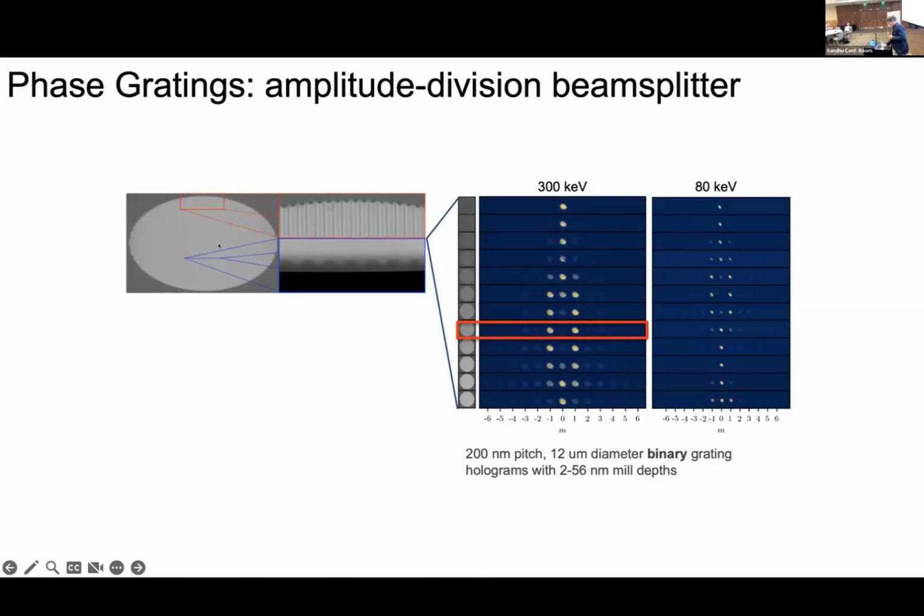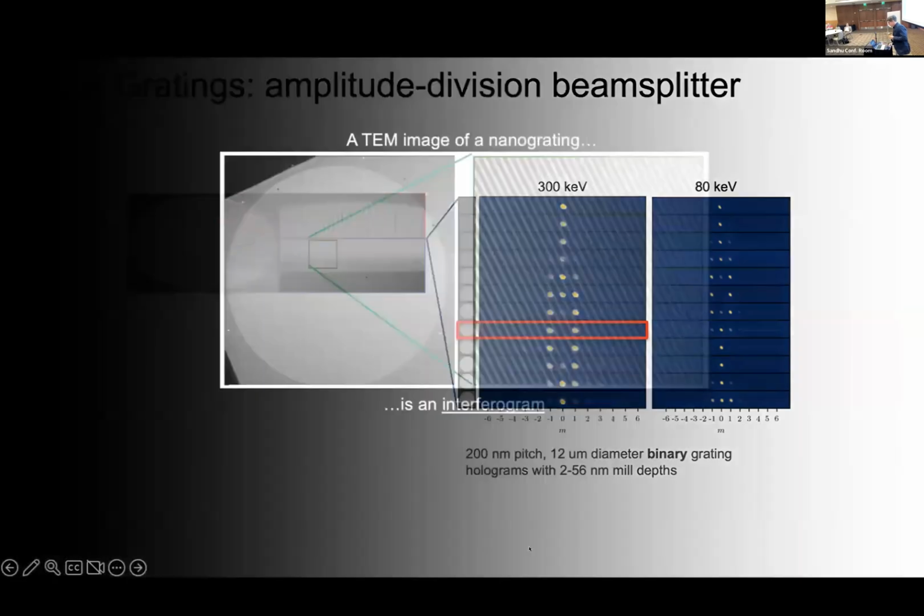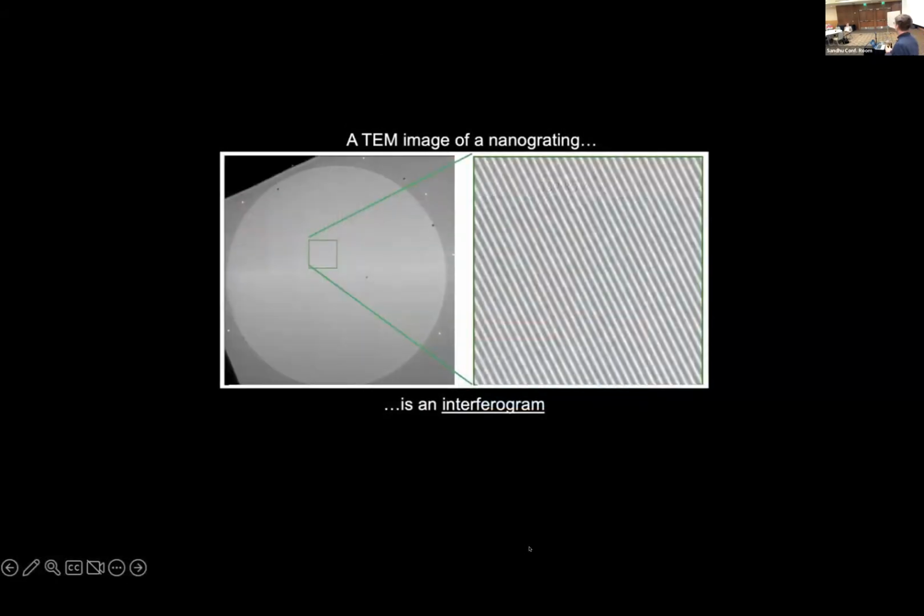Okay. Well, we put this grating in our microscope. When we take a picture, we want to see if we made the right thing. The spacing of these grooves is as small as we can make it. We've made them down to 40 nanometer spacing. Typically 100 or sometimes 200 nanometers is what we'll do.